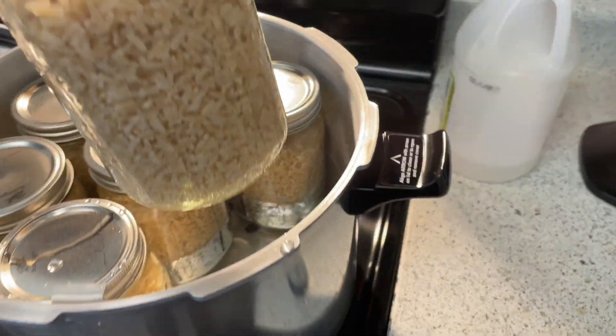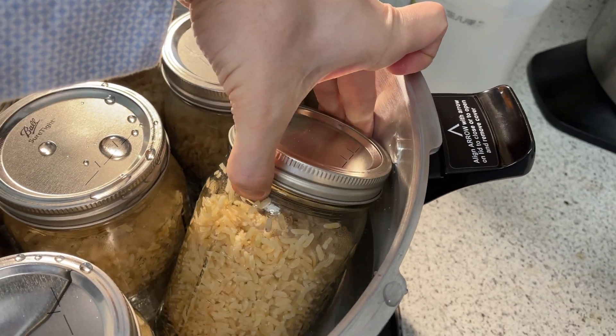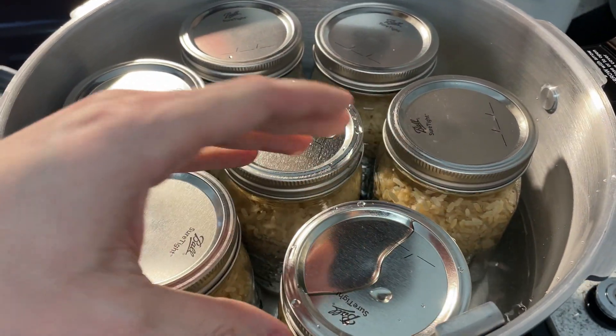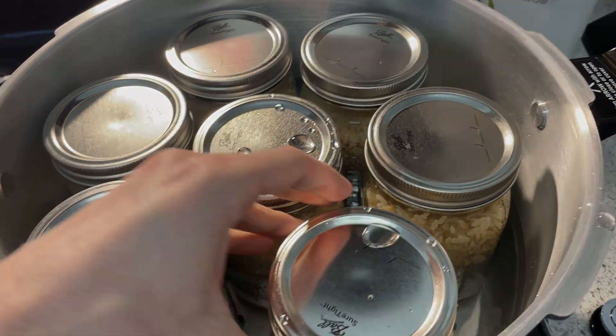Throw that last one in there. It does say to try to avoid any water bubbles underneath, so just try to tilt that jar. After I put the lid on, I tilt the entire pressure cooker. You don't have to, but if you don't, it could mess with the pressure inside along with the temperature.